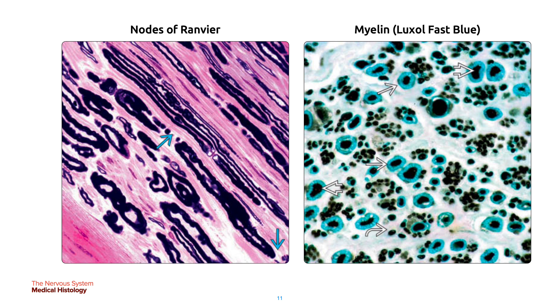On the left is a toluidine blue longitudinal section showing the nodes of Ranvier in a single blue arrow, seen as the gaps in myelination. The internodal segment myelinated by a single Schwann cell is shown here. On the right, Luxol fast blue stains myelin in a single white arrow in blue-cyan, with large diameter axons in the bold white arrow stained black with the Bielschowsky stain. Small diameter axons in the curved white arrow are unmyelinated. This can identify demyelinating and remyelinating processes.